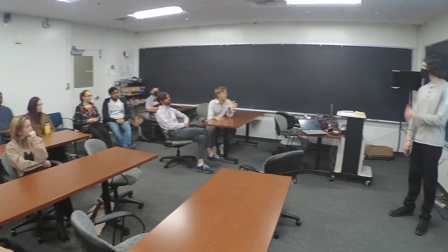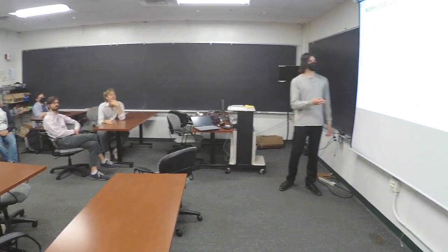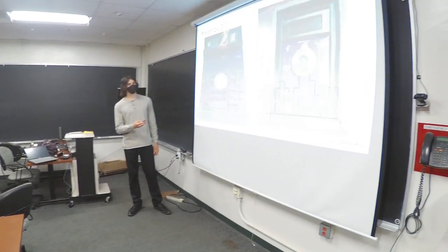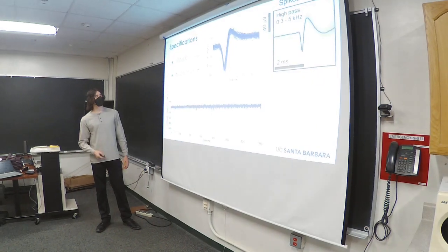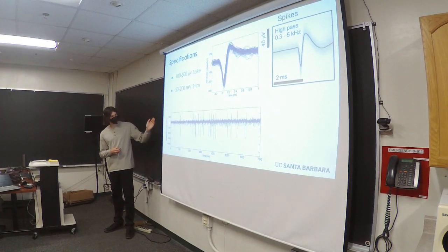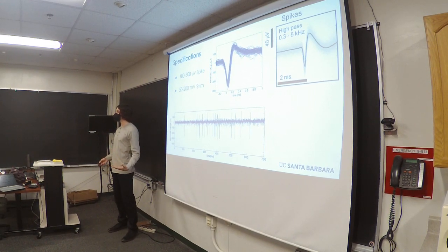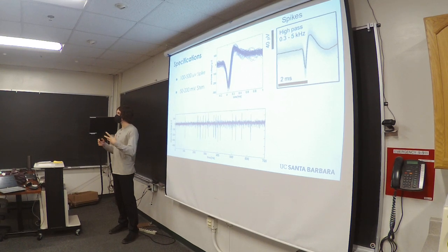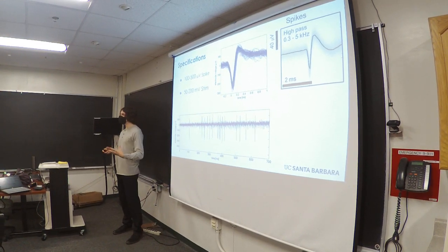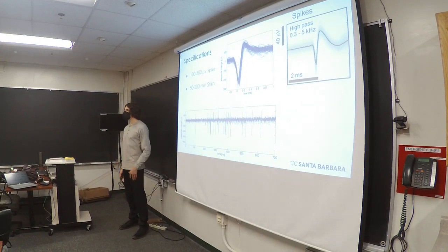Do you have any idea what the noise level would be, and from what sources? You said the signal is like 500 microvolts. Do you have any idea what level the noise would be at? I have a backup slide for this. There's just this noise here, which looks like around 20-ish microvolts. And then there are also these local field potentials, which are the noise of all of the cells firing in tandem and how they all interact with each other. To be able to study, say, an individual cell, you need to be able to get rid of that. And so that's where some of the filtering comes in.